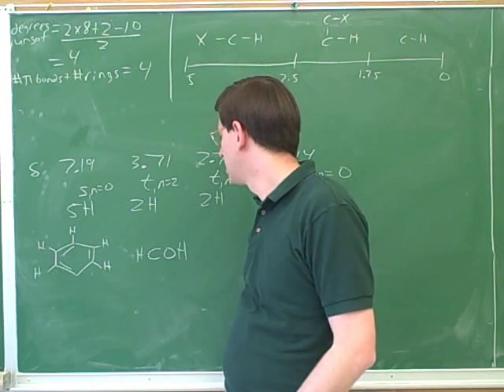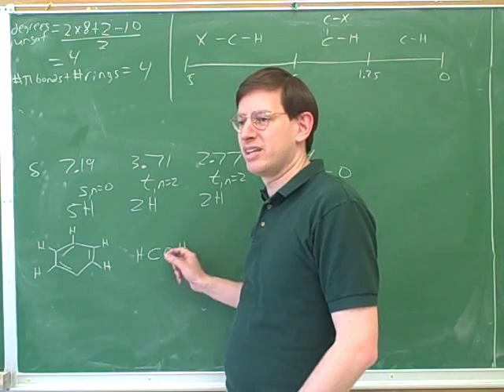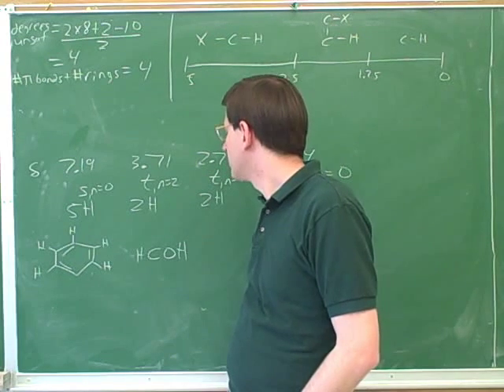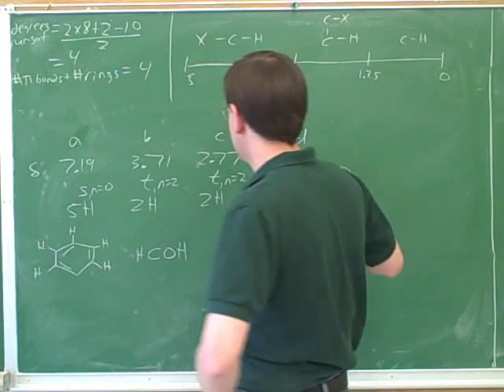Well, they both have to be group B since they're two hydrogens. They can't both be group B because they're not in the same environment. I understand that, but they're both two hydrogens in part. What group are they going to belong to then? Right. Okay. So, A, B, C, D.